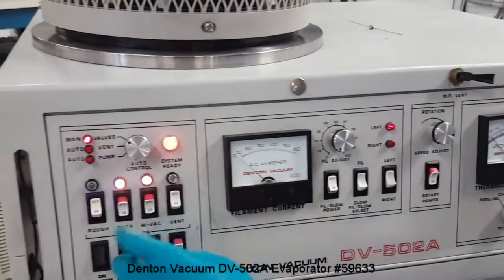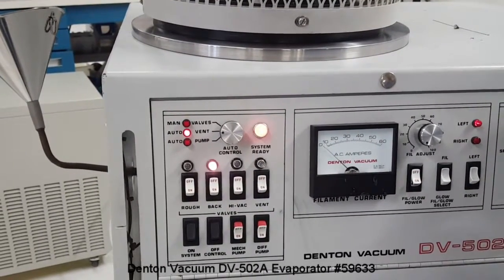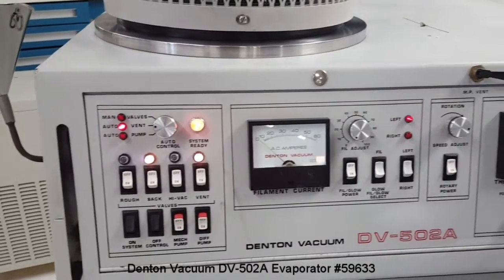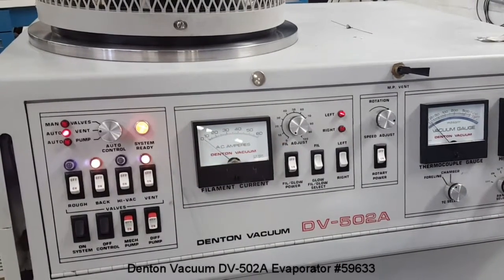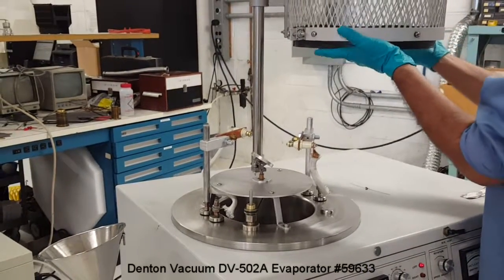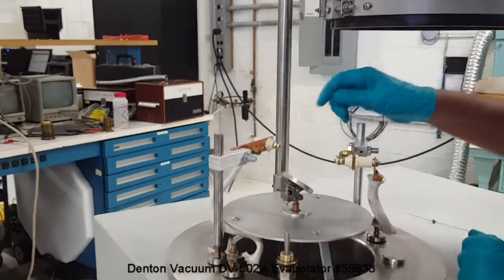Now I'm going to cycle the system — the venting of the chamber — to demonstrate. It takes a couple of minutes for the chamber to vent. The cold cathode gauge turns off itself as soon as the vent valve is open. When venting the chamber, the bell door should be slid up and rotated. The bell door is held here. So I'm going to load a small piece of aluminum in the thermal evaporator.